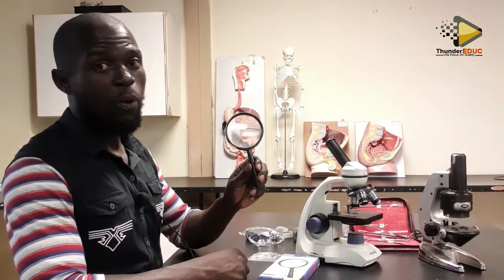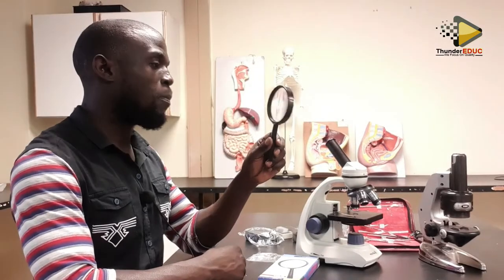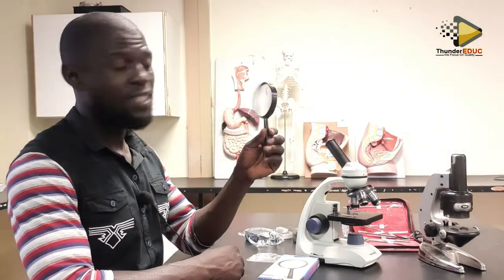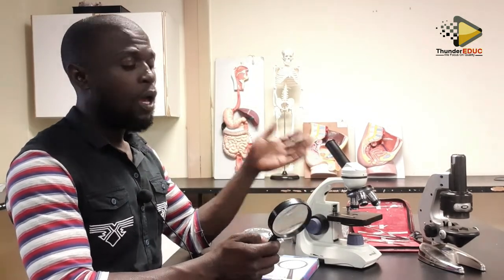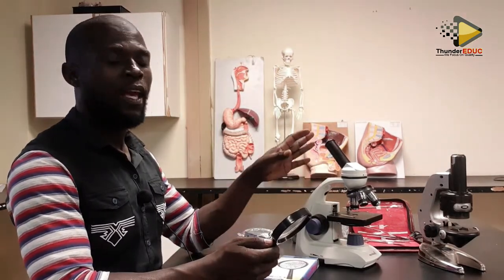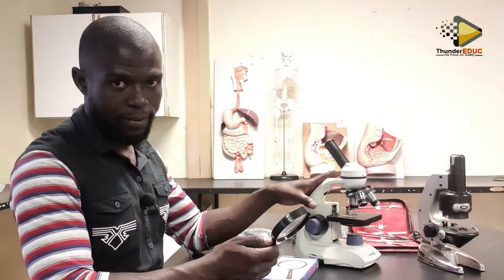An example is the hand lens. Here is an example of a simple microscope. It has only one lens. It's a hand lens. We call it a hand lens because we use a hand to view. Its magnification is not that big compared to the other ones. Because its magnification is low, they had to advance it to another microscope, which you're going to see.